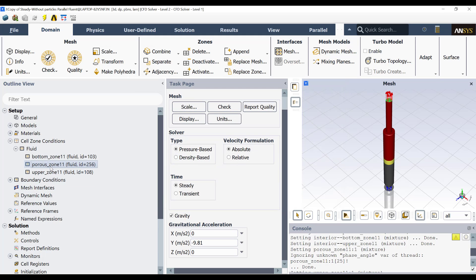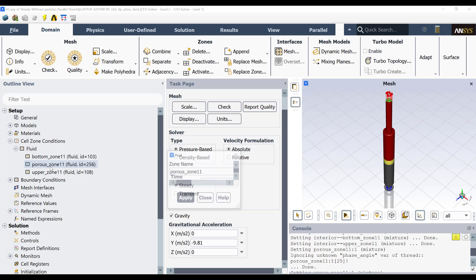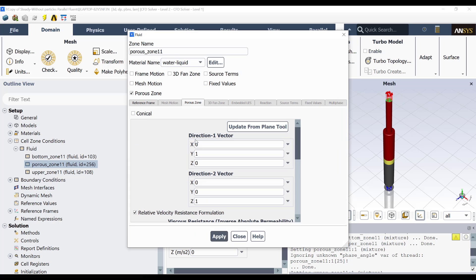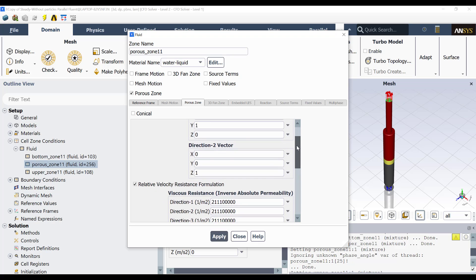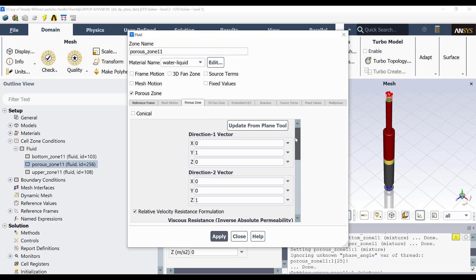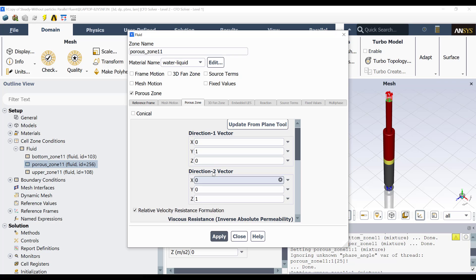And for the porous zone, then you have here, then it is water liquid. This is porous zone. And here in porous zone, you have the directions of the restrictions. Then this is for the velocity field, or how the porous media is formed, in which directions.